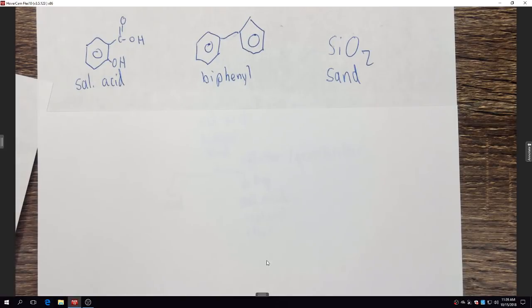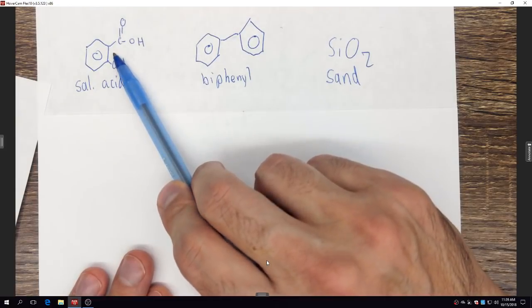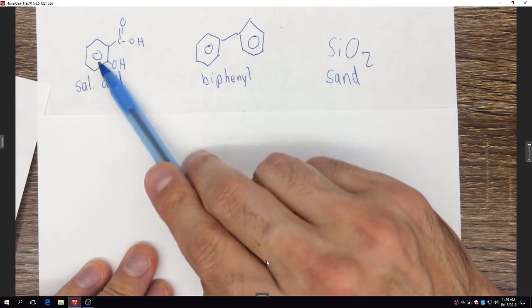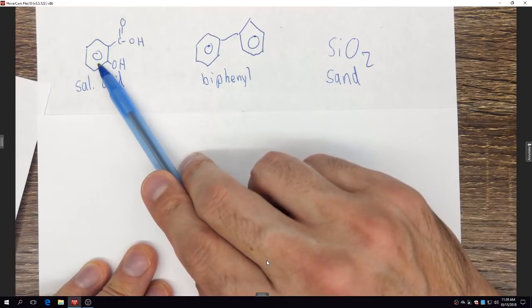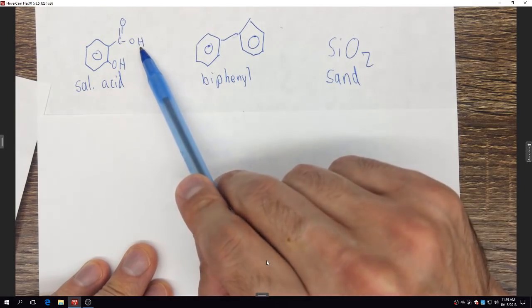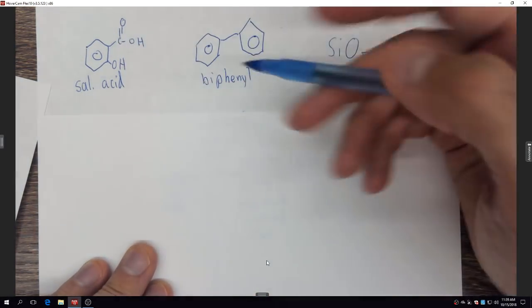Let me ask you a more general question. What do acids in general, are they well known to react with? Bases. Acids react with bases. Carboxylic acids are not an exception to that. Okay, if you have ever seen the reaction of baking soda and vinegar, right? It produces carbon dioxide gas. This is essentially what you're doing. This is a different carboxylic acid, but vinegar contains acetic acid. All right, a 2-carbon carboxylic acid.